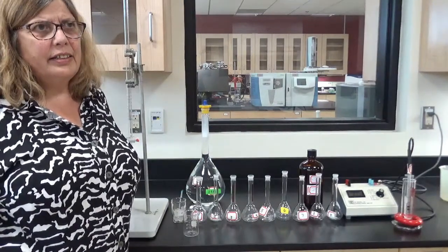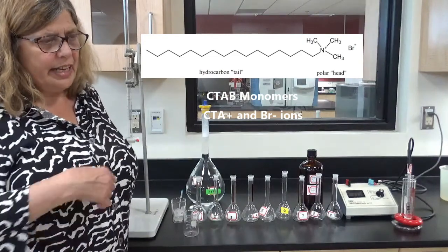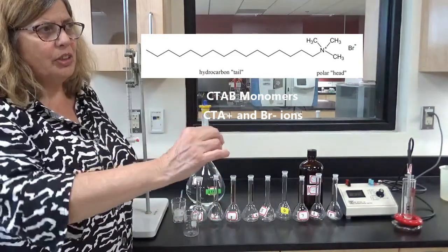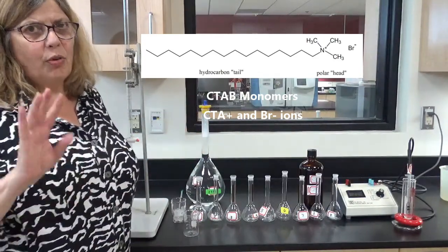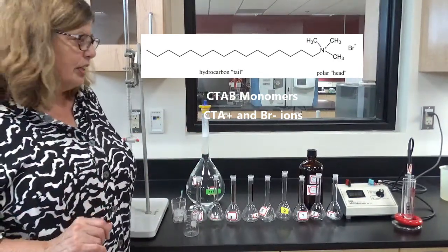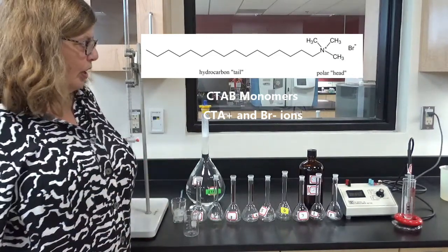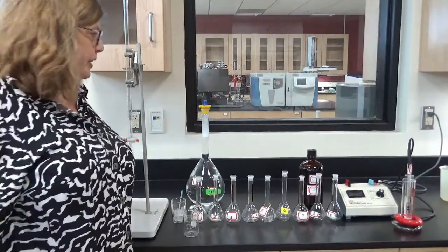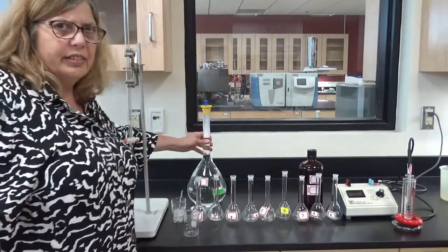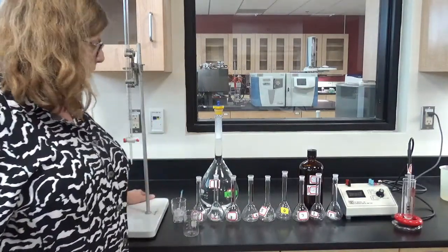It has a very long hydrocarbon chain, and on the end of that chain is a nitrogen, which is bonded to 3 methyl groups. So it has 4 bonds and it has a +1 charge. And the bromide is a counter ion. So I made up a solution of this CTAB in water. It's over here, the stock solution that I'm going to be using to make all these other solutions from.